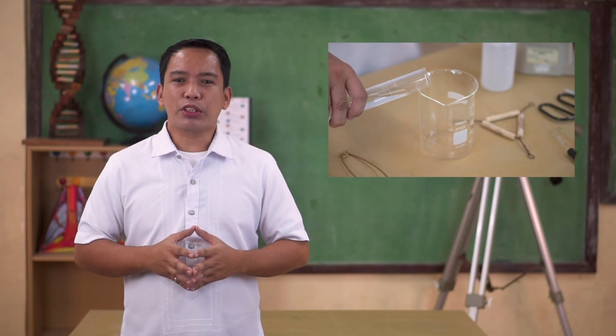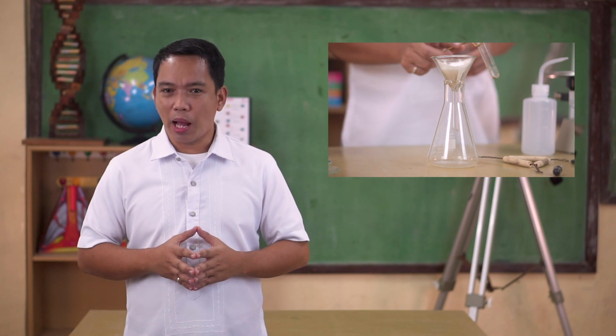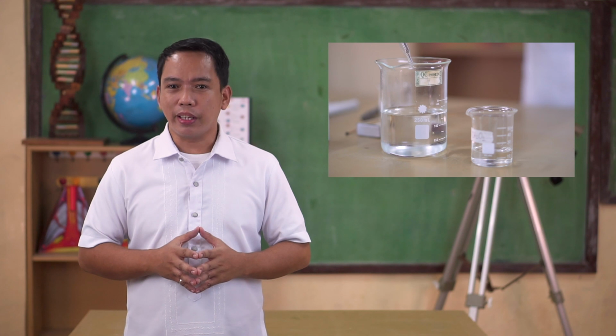To get positive results in our experiments and to prevent accidents from happening, there are precautions that must be observed before, during, and after an experiment. Finally, the success of an experiment does not depend solely on the use of apparatuses and equipment, but also on the techniques in handling them and understanding the necessary precautions.